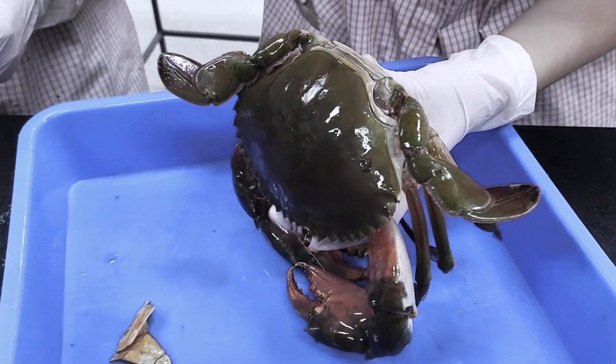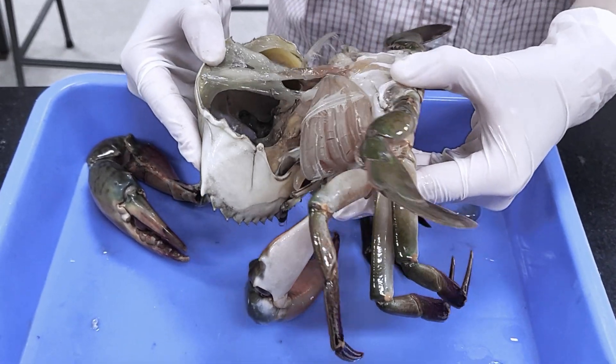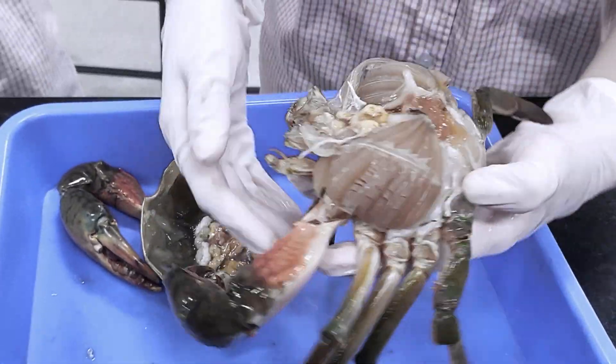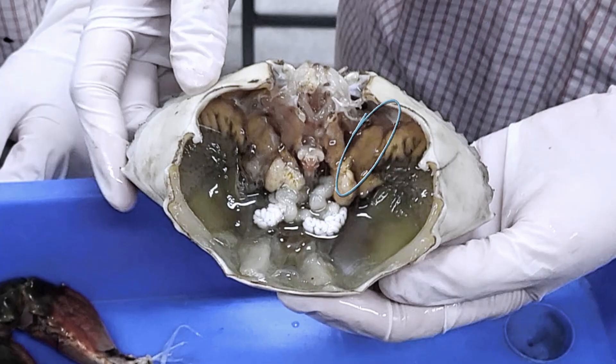Next are its internal organs. As a male, it has sperm — the white color means that it's mature. Over here we can see the hepatopancreas which, in addition to being a vital organ for nutrition absorption and storage, is also capable of synthesizing digestive enzymes required for food digestion.